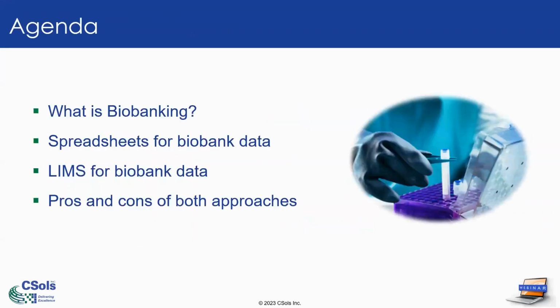So what are we going to be talking about today? I want to quickly touch on what biobanking is, just make sure we're all on the same page, and then dive into 2 possible approaches for tracking your biobank's associated data, spreadsheet and LIMS. I'm going to go through pros and cons of both approaches. Spoiler alert, I'm going to come down pretty heavily on the side of LIMS. And then at the end, as Megan said, we'll have some time for questions. I anticipate talking for about 30 minutes, and that should leave about 30 minutes for the questions. So let's dive right in.